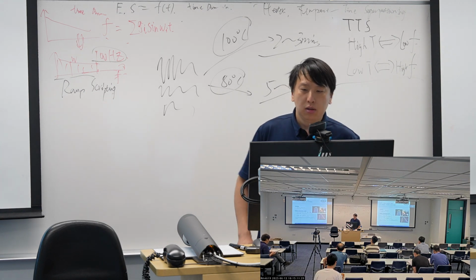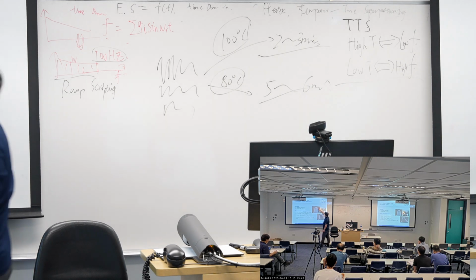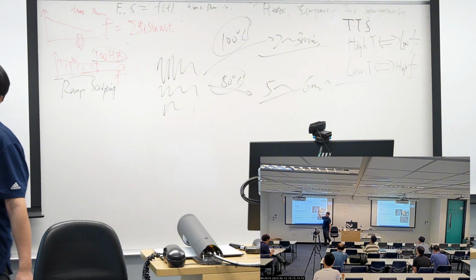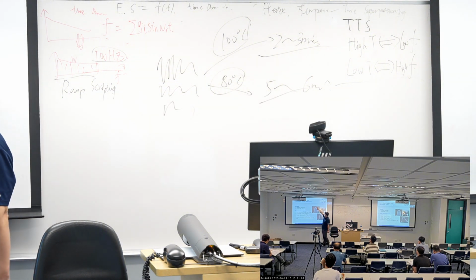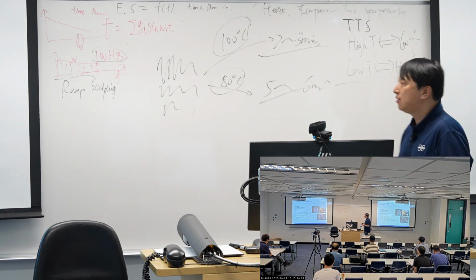And the thing we need to discuss here is we highly recommend you to use the spherical probes, as the radius will be fixed. Why do we insist on that?